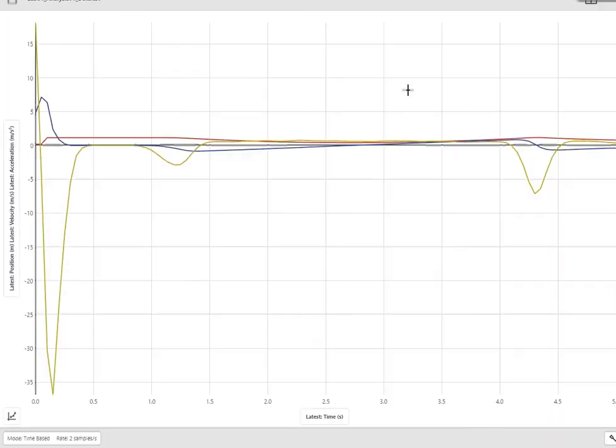Okay, this is pretty good. It gives me all the data on one graph, which might be useful. There might be times when you actually want to do that. Typically, probably not. So how do we split that up then?